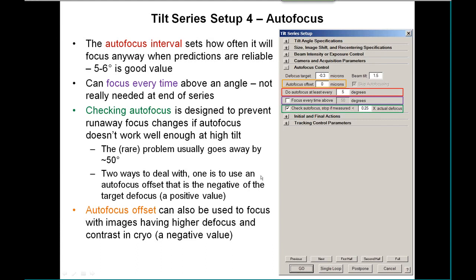There are two ways to deal with runaway focus. One is to use an autofocus offset that is the negative of the target B focus. The autofocus offset is an amount that the focus gets changed before taking the focus pictures, and then changed back after. You can also use this to take focus pictures at a higher defocus and higher contrast, which is useful for cryo — in that case you would put in a negative defocus value.